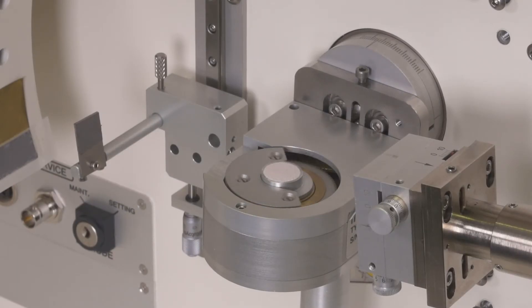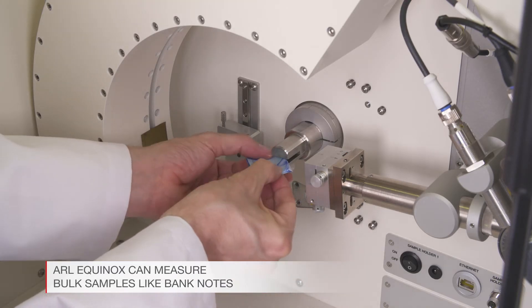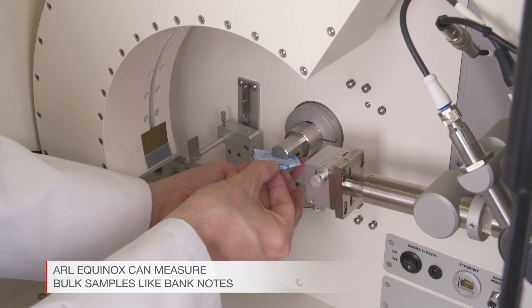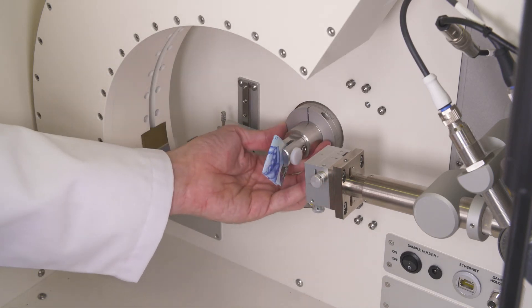For counterfeit analysis, the ARL Equinox is not only able to measure powders, but also bulk samples like banknotes. Such samples can be clamped and measured in transmission or reflection.